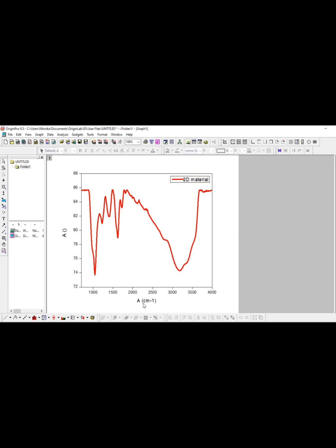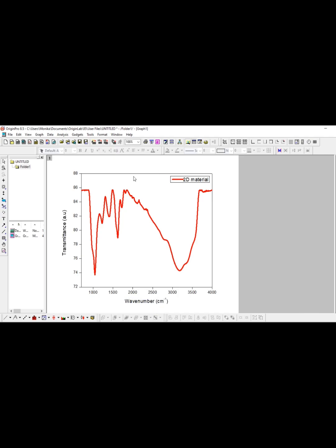Similarly, if you want to change the x-axis value, you can change it. You can write wave number, okay. This is the figure. If you want to change the font of it, you can change from here.